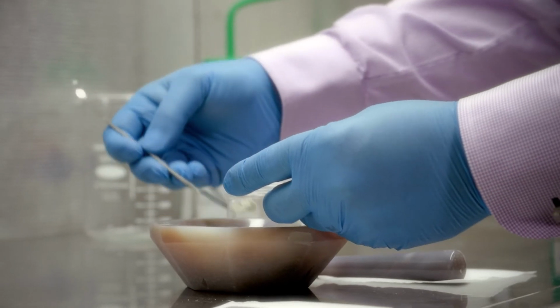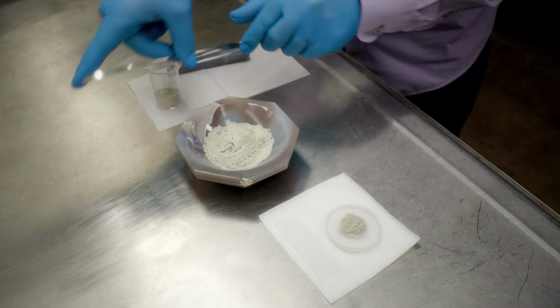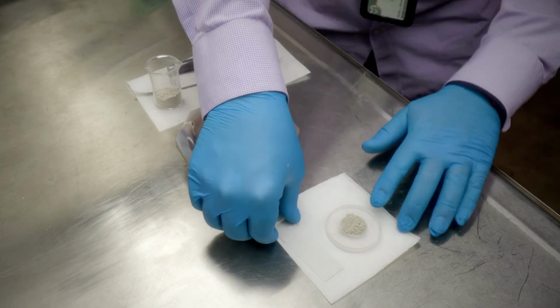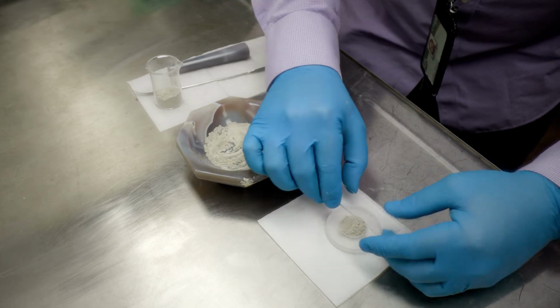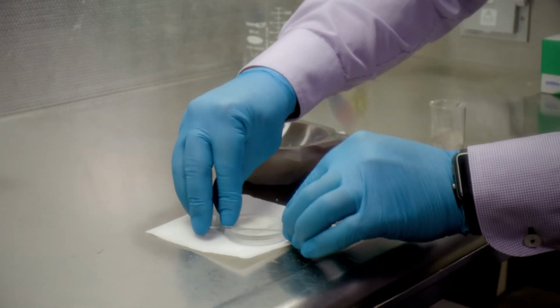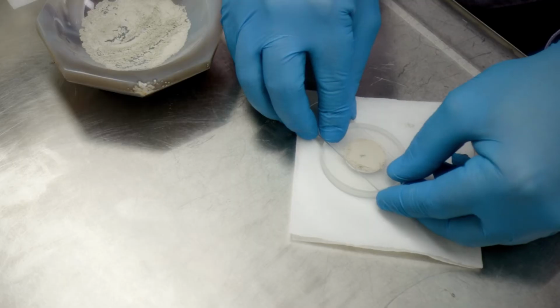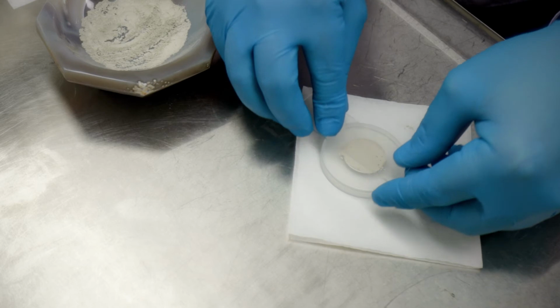In either method, the idea is to get the sample as even as allowable within the size of the sample holder. This ensures the proper sample height during data collection. Deviations from this, higher or lower, will result in 2 theta shifts of the observed peaks. The sample should be well packed in the sample holder. A glass slide may be used to assist.